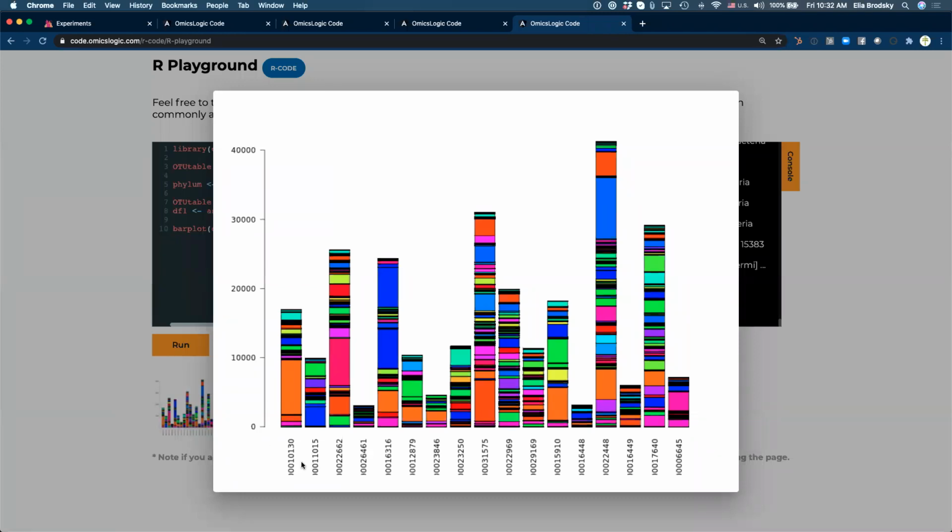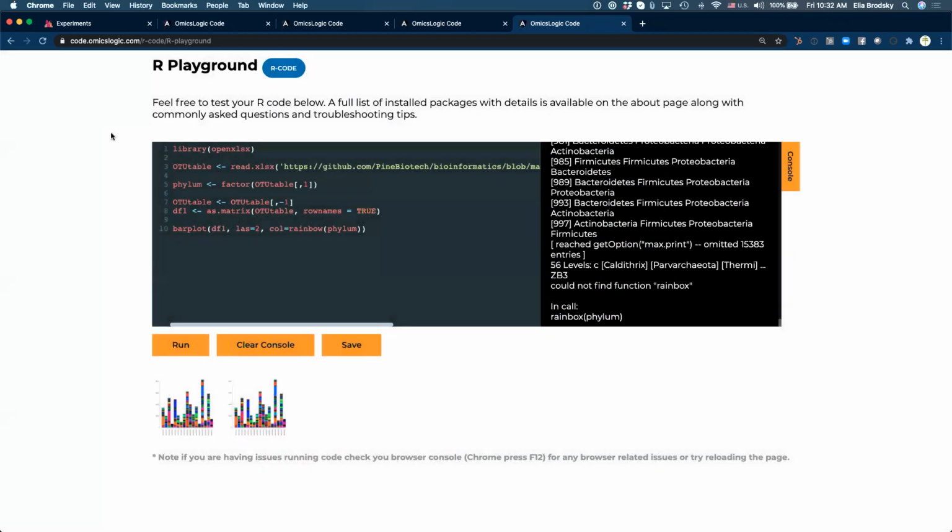If you look at the samples, they are different by these names. Let's not worry right now about how to modify everything in this particular group, because what we want to do now is compare the two different groups, and that's going to require a little more playing around with the data before we move on. Most of the time, the errors are going to be spelling or some kind of syntax.